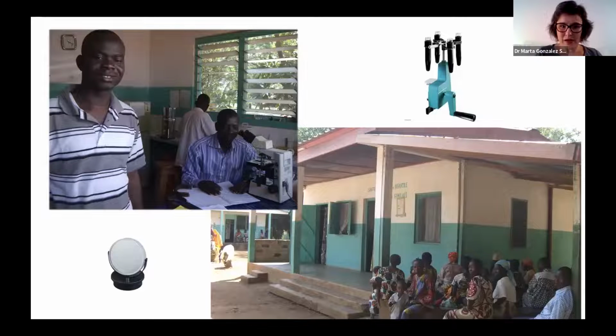You can also see one of my colleagues at the microscope, writing the results for the patients in a notebook. That fridge was operated with petrol, and the microscope that seems to be plugged in is not really plugged in, because we only had the generator on during the night, and during the day if we needed oxygen for any of our patients. So most of the time we had to use the little mirror that you can see on the bottom left of the slide to use the sun to power our microscope.